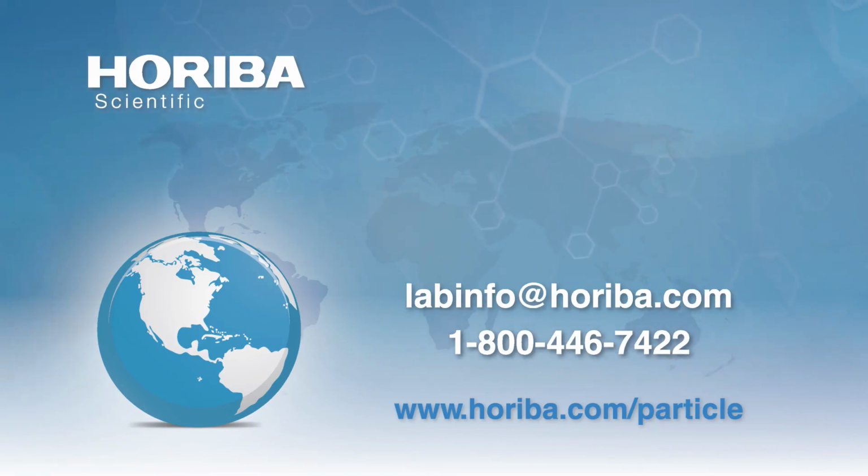If in point of fact it ends up being 70% T, that tells you you have some leftover particles somewhere in the system that you have to get out before you run your second sample. If the number goes up, that's telling you you've diluted your sample. Somehow, as you were draining your fluid, you didn't do a particularly good job of draining it, so you should drain and start all over. So the instrument itself kind of tells you when it needs to be cleaned just by how it's behaving.